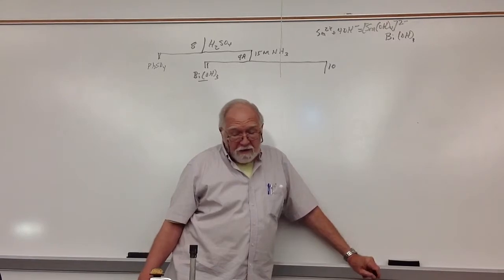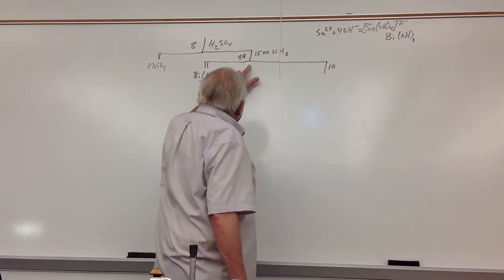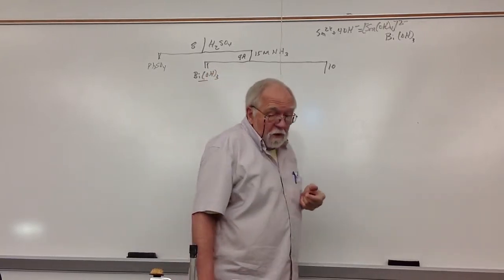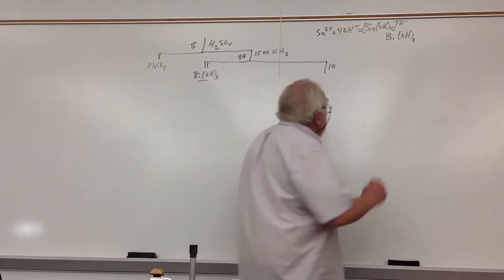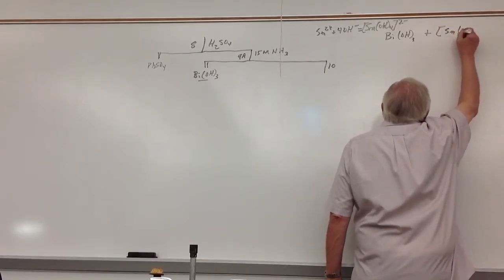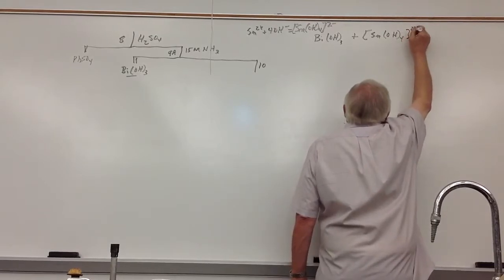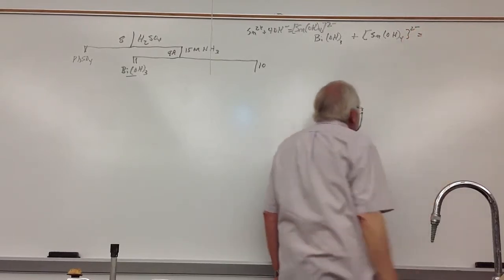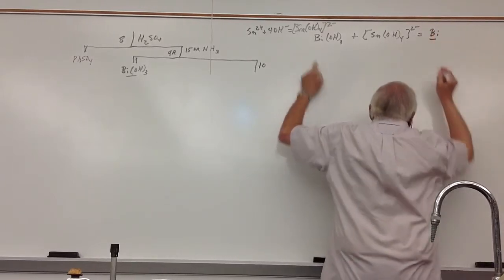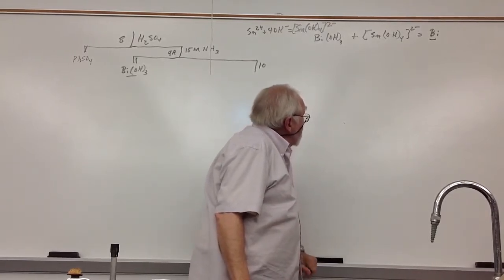So he says 8 drops, that's usually sufficient, because you're working with a basic solution already. But if you see white precipitate, just add some more sodium hydroxide. This is going to react with bismuth, and he has the equation in your book. I just like to write equations sometimes, so I can show you what happens. This goes to metallic bismuth. Okay. That's a redox equation.